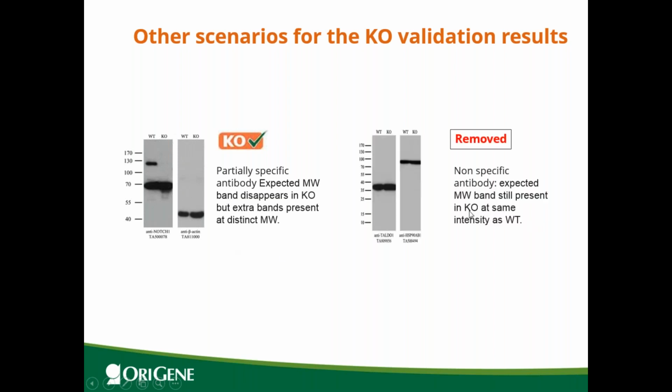In some rare cases, we also see the antibody pick up similar bands from both wild-type and knockout samples with the same intensity. So this indicates the antibody is not specific for the protein, and for this type of antibody, we'll have to remove it from our website.